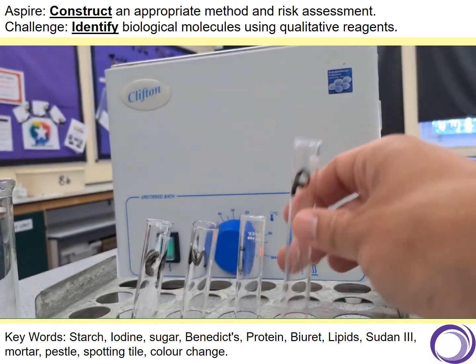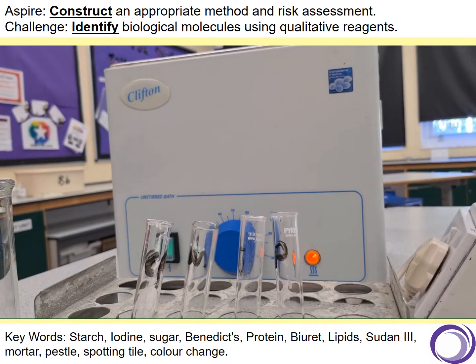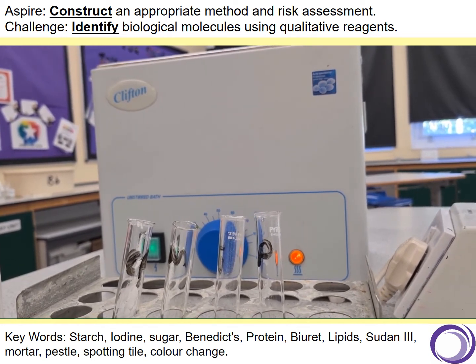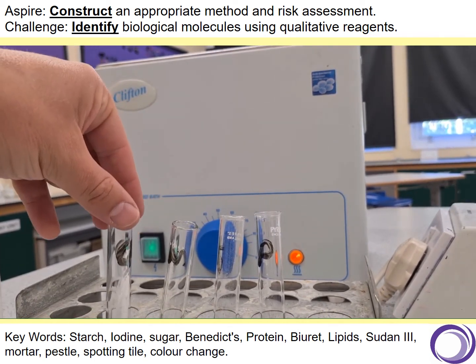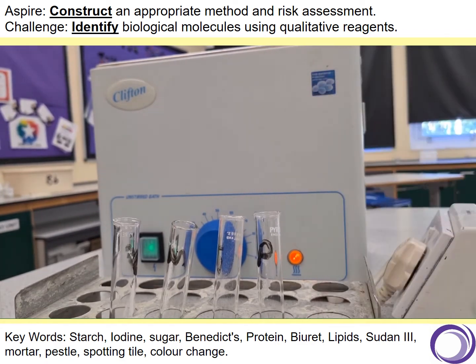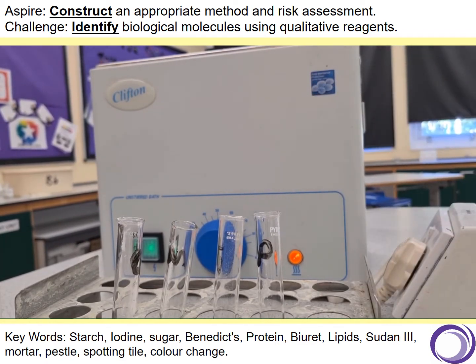What we're going to do is test for sugars. For this, we need to make these powders into a solution. So I'm going to add some normal distilled water into each one of these test tubes.